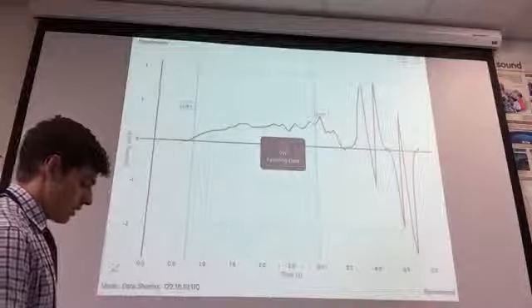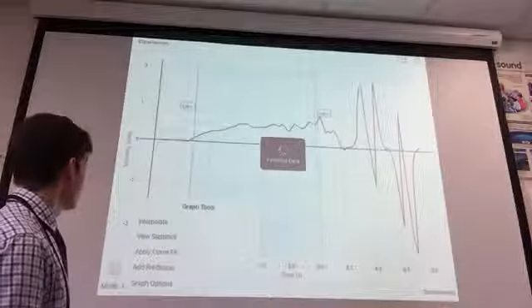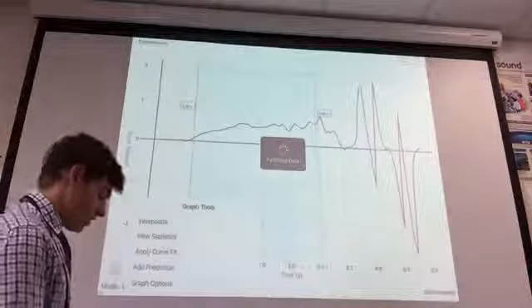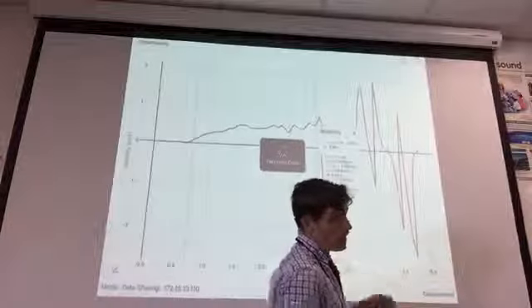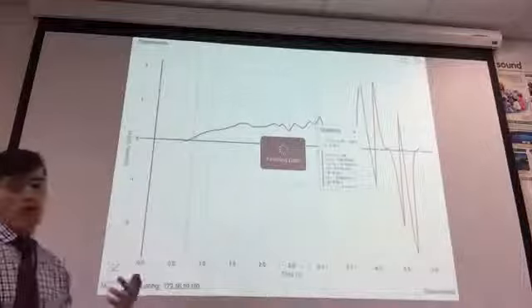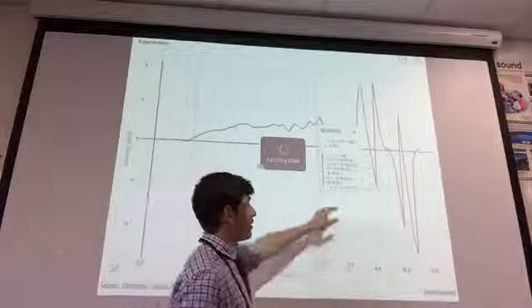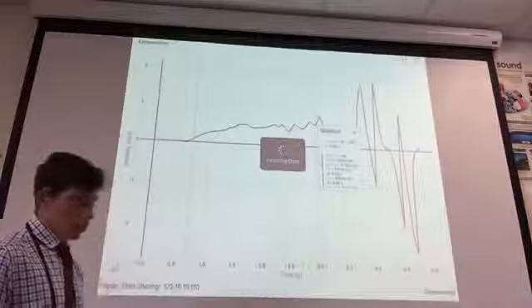Hit the same button in the corner there, and instead of hitting apply curve fit, I hit view statistics, and up there I can see that my mean is 0.434. It is very similar, but it's not exactly the same. It doesn't matter which method you use in this experiment, providing the fact that you use the same method. So you either use the mean or the gradient.